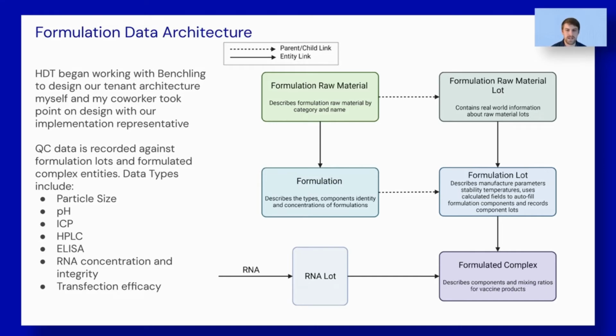Using a number of different data types, anywhere from pH and particle size, which are more common for formulation lots, or transfection efficacy in vitro or in vivo, which is more common for formulated complexes.